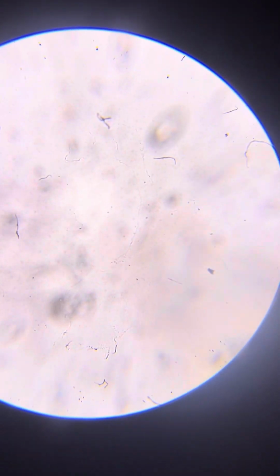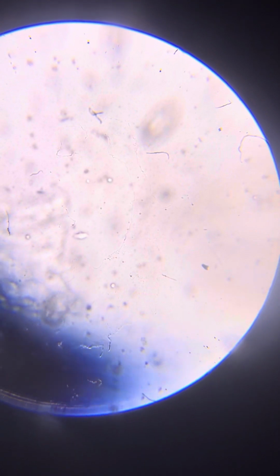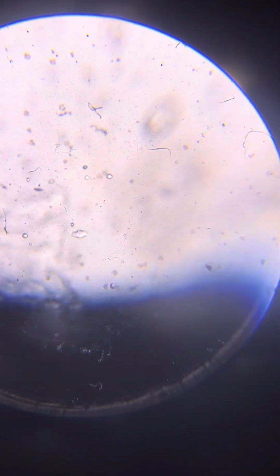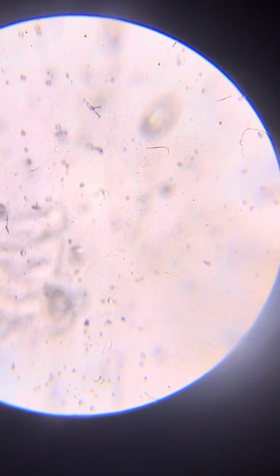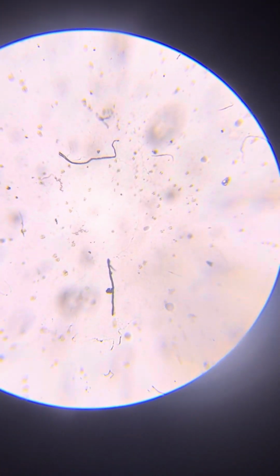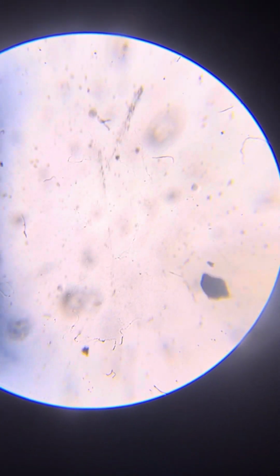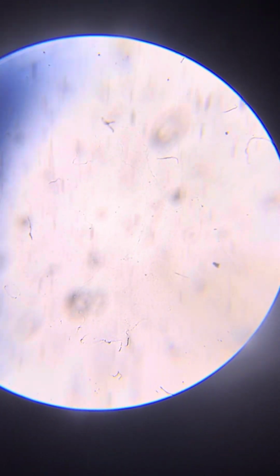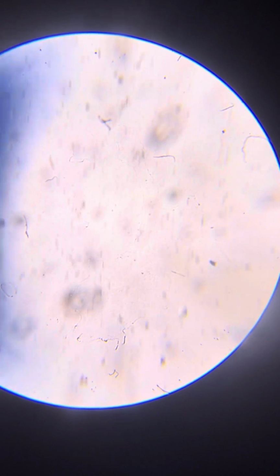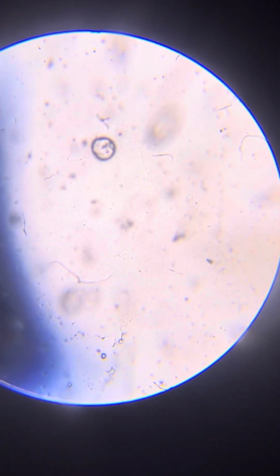So again, this is the reference slide. It shouldn't be extremely interesting. It's just to see what was before in the solution, before the electrolysis. Not much.